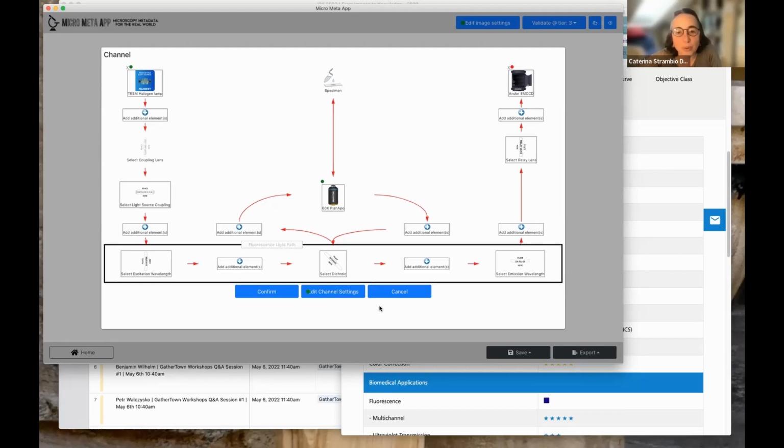For example, we definitely would love to have input from users that start using it. Like, how do we choose which one has been changed across individual images? And the other thing is to make sure that these things are captured in the header of the file, so that when we import it, more and more of it is going to be imported automatically.